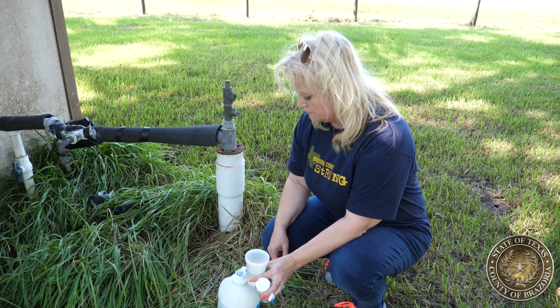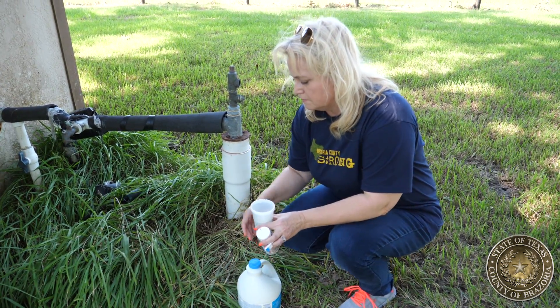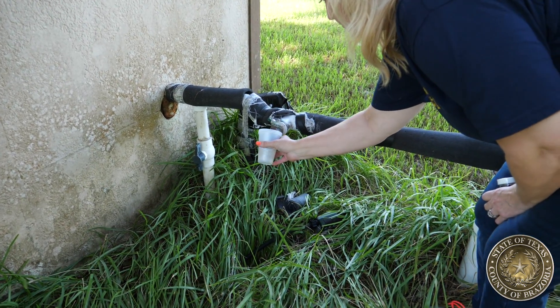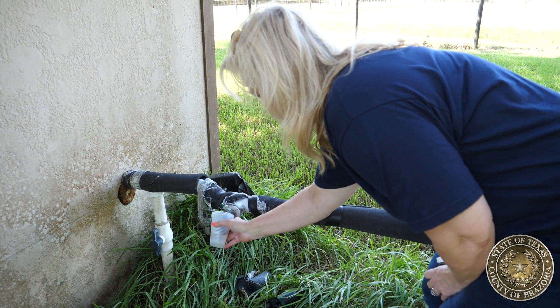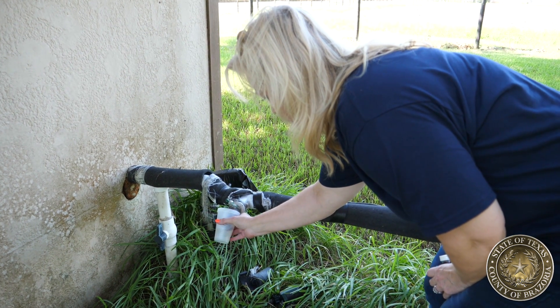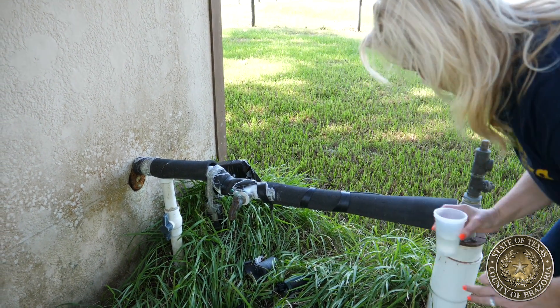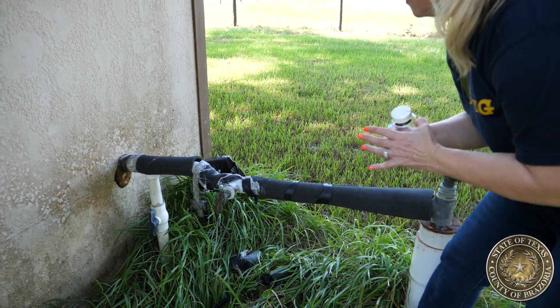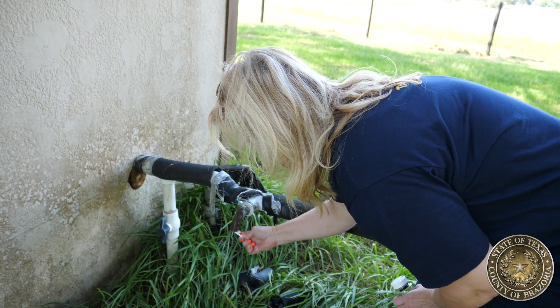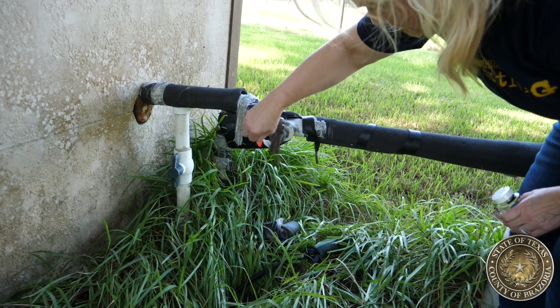First, we would like to disinfect the faucet with bleach in a cup. You'll place the spigot into the cup of bleach and allow it to sit for several minutes. This will help to disinfect the outside area of the spigot. We'll also take a toothbrush to clean the inside and outside of the faucet, loosening any bacteria or debris that may have come from the dirty water.